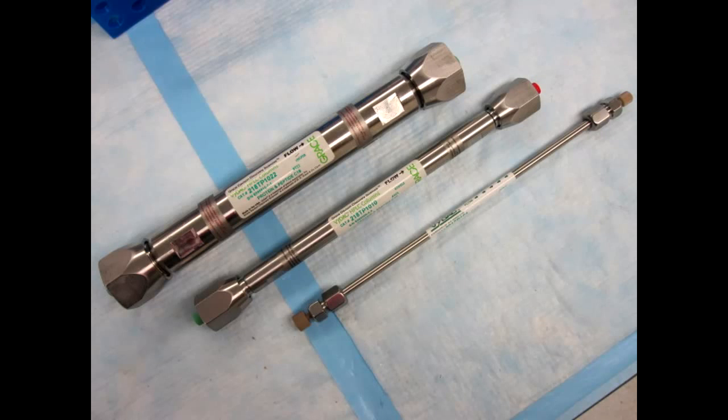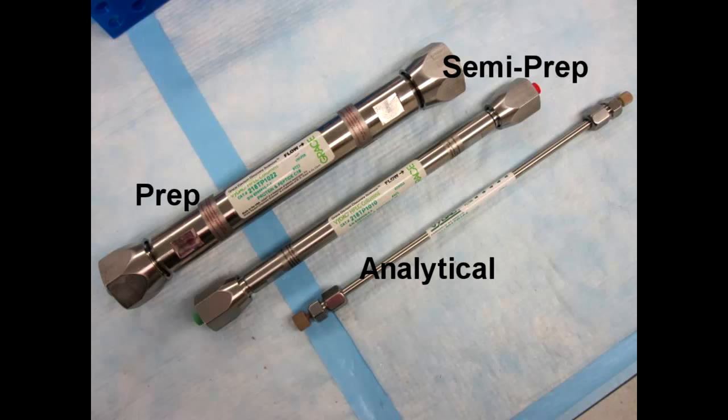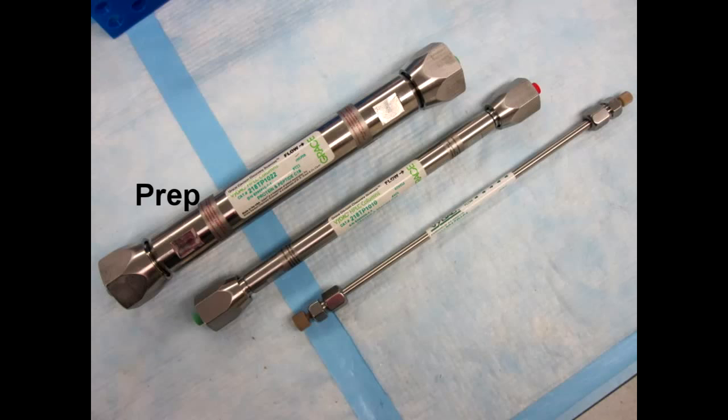The three sizes shown here are prep, semi-prep, and analytical. For the prep column, the largest column, we add 5 to 10 milligrams of peptide each run. For the semi-prep, it goes down to about 1 milligram. And lastly, for the analytical, 0.1 milligrams of peptide is the recommended amount. These amounts are based off of a 2 to 3 kilodalton peptide sample.